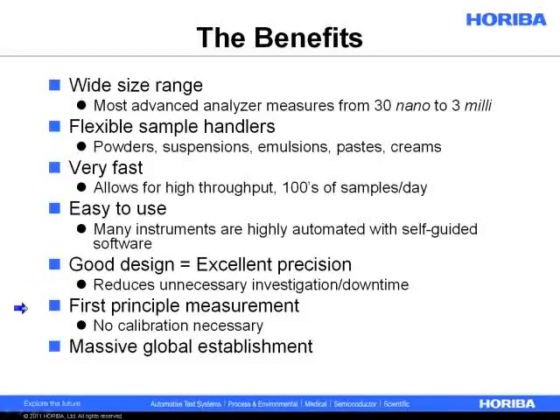Again, it's a first principle measurement. No calibration is necessary. It gives you a little bit better peace of mind in the results. You don't have to teach the analyzer what the correct answer is. It either knows it or it's broken.